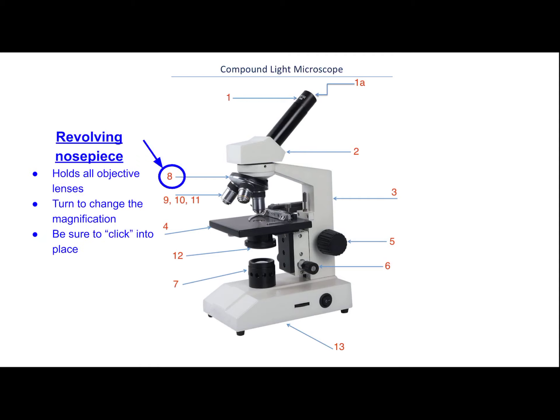Number eight is the revolving nosepiece. This holds all three of the objective lenses. You turn this to change the magnification. Make sure when you turn it that you feel the little click to ensure the lens is completely straight and in place.